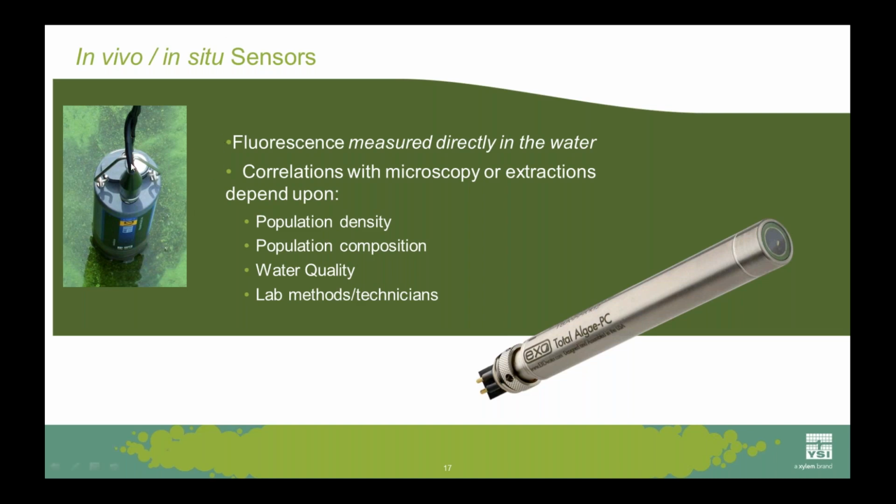You can see here a YSI water quality sonde of the vintage age. Some of you recognize this and probably are still using it. This is our 6 series sonde, the 6600 V2. These technologies, even evolving as they are, are still most powerful when paired with some of the other methods we're talking about and that I've already shown you.